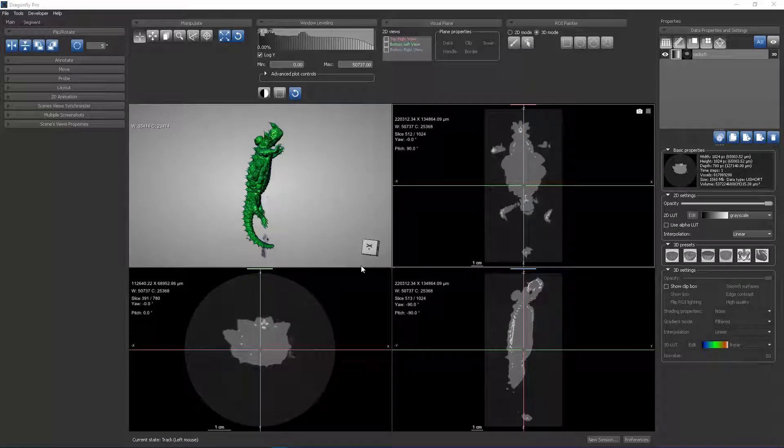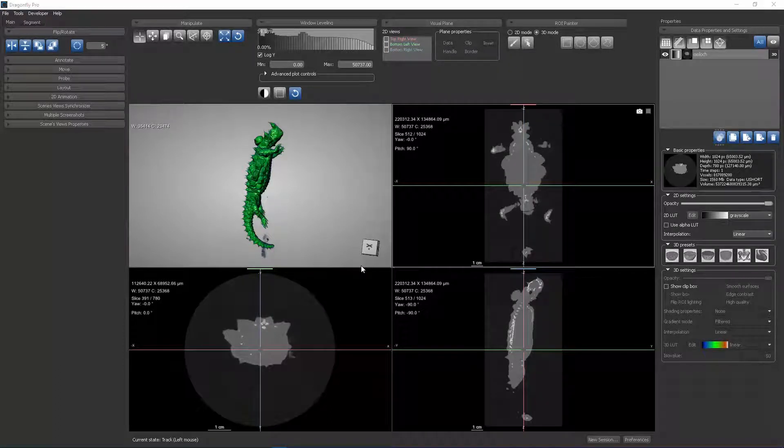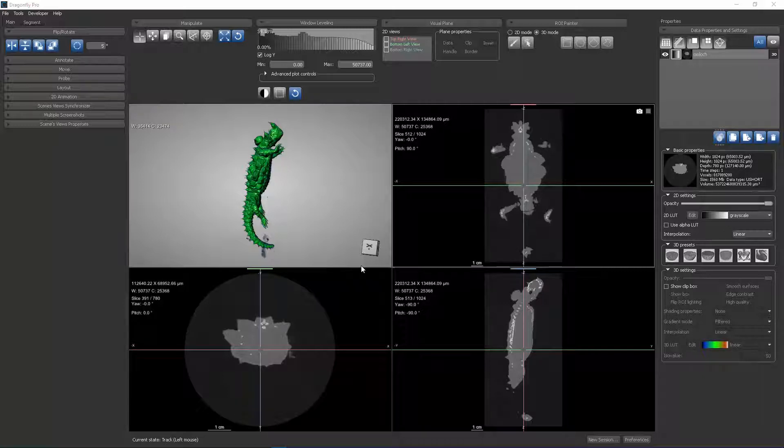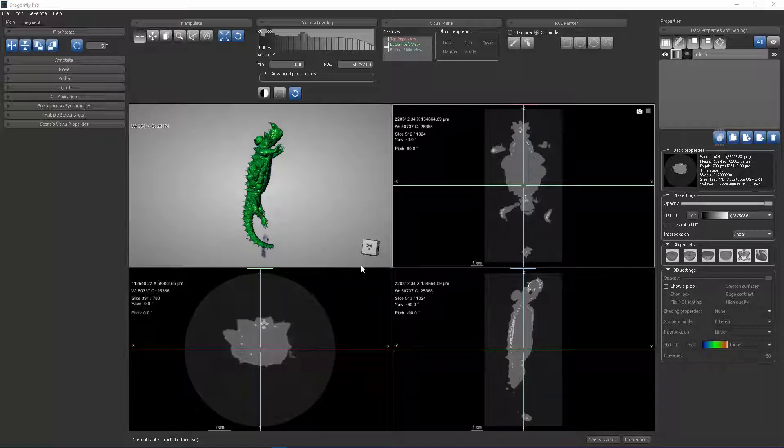In this Dragonfly 3 training video, we're going to look at the Manipulate panel. The Manipulate panel is fundamental and basic to operating your 3D and 2D scene and for interacting with it.